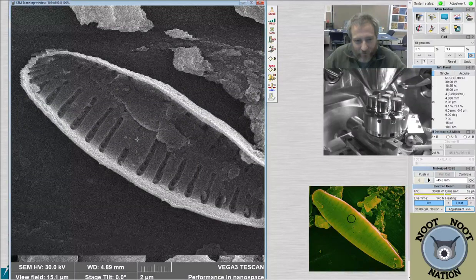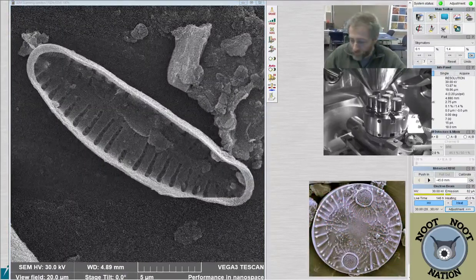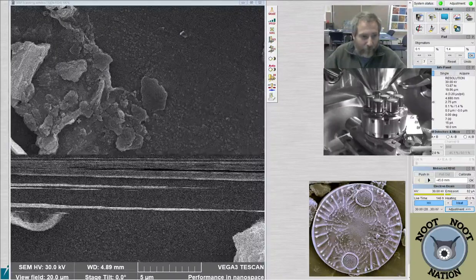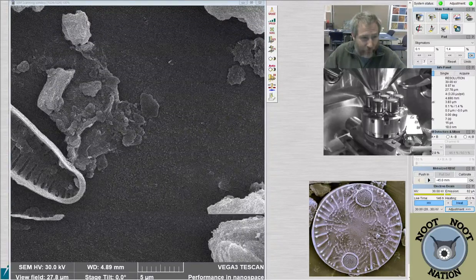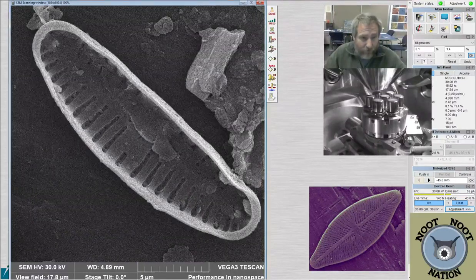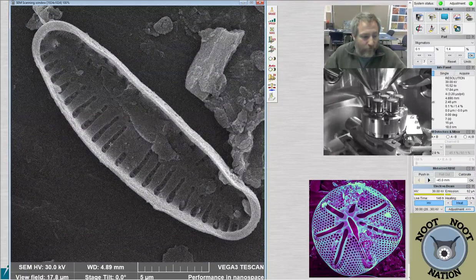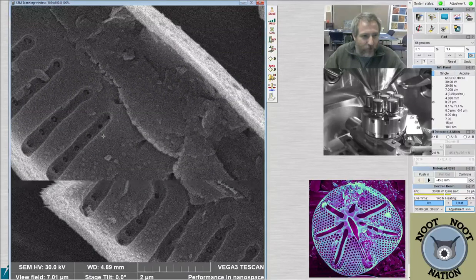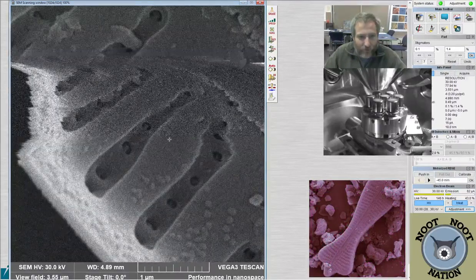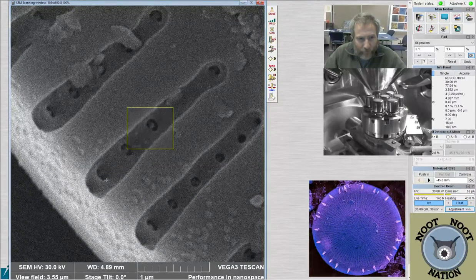So this is an interesting diatom. Again, this is a common riverine species, or species that's usually found in flowing water or wave energy water, what we call rheophilic species, or species that like flowing water. And this is the genus Reimeria, named after the fabulous diatomist Charles Reimer, who I met when I was learning diatoms in the diatom science training camp, or whatever you want to call it, in Okoboji in 2000. He subsequently has passed away, but is revered by the entire diatom community as a very well-respected and well-known taxonomist in his time. And this genus was named after him.